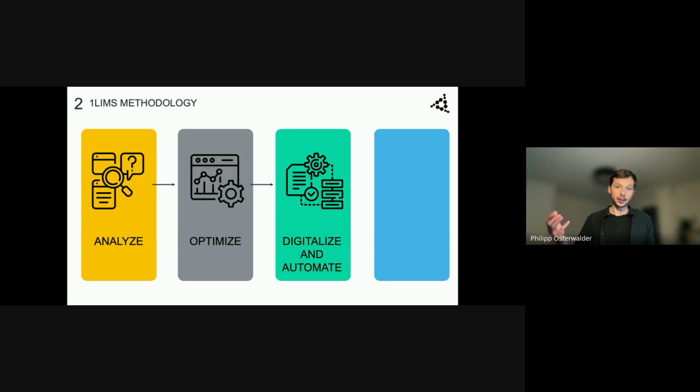And after a user testing and also an internal validation, we start together with the clients to automate, as mentioned before, the evaluated workflows which bring first the most added value, the most benefits, and secondly the workflows that are the most routine or most time-consuming processes in the quality and laboratory.